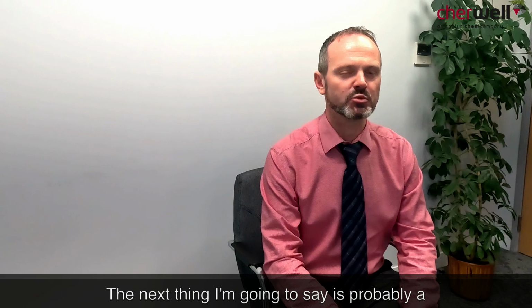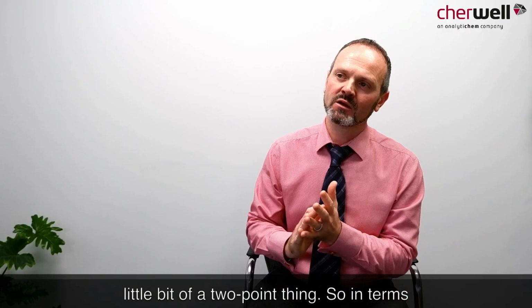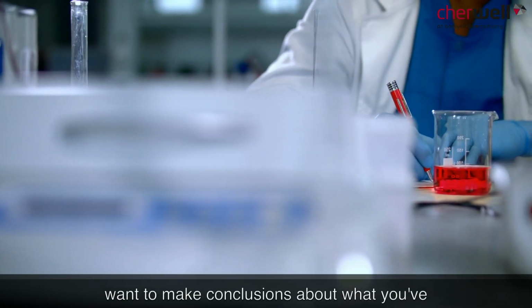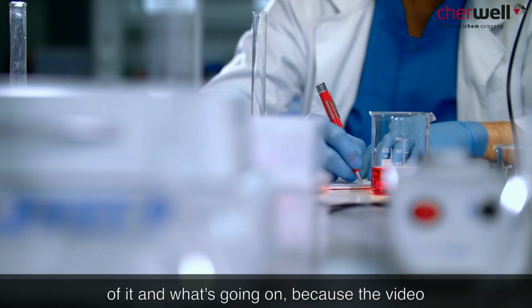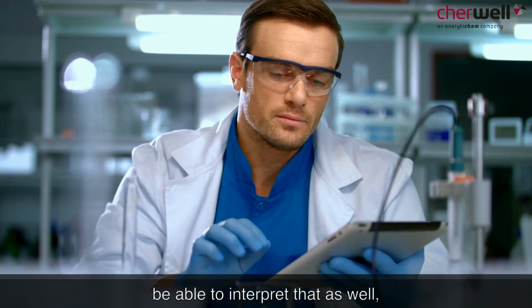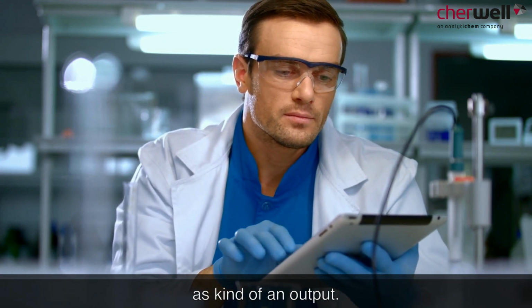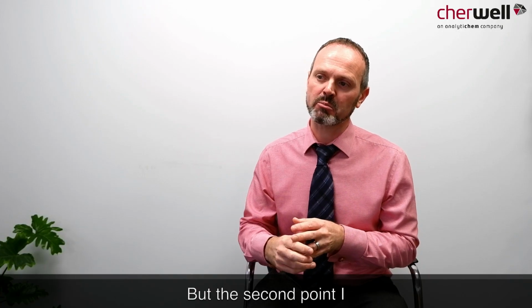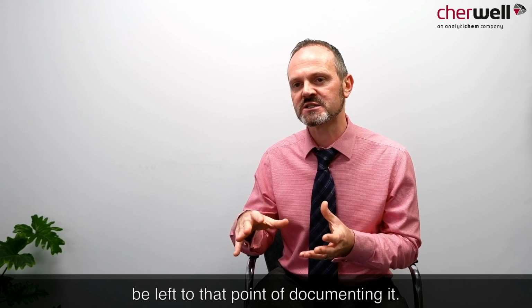Probably the next thing I'm going to say is a little bit of a two-point thing. In terms of actually documenting it, you obviously want to make conclusions about what you've seen about the airflow, about the description of it and what's going on, because the video will tell you one thing, but you want to be able to interpret that as well, and understand what you're going to do about it as an output. But the second point I want to make is that it shouldn't be left to that point of documenting it.